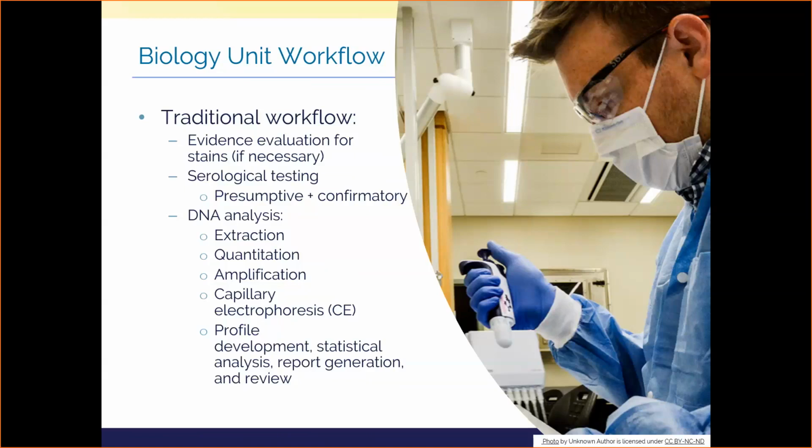From a sample processing standpoint, there's usually two phases to serological, otherwise known as body fluid, testing in most cases. A presumptive test that helps us rapidly determine what a stain may or may not be, and then followed by a confirmatory test to shore up our results and ensure that what we are looking at is indeed a body fluid that warrants further analysis.